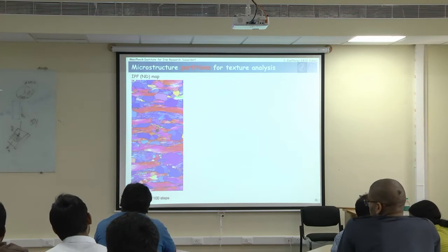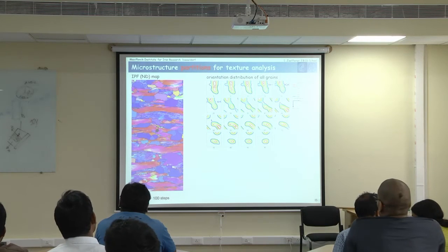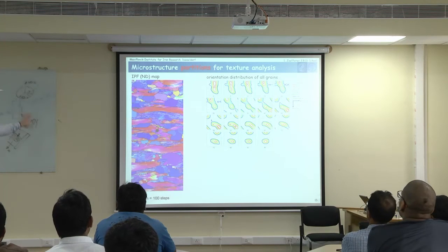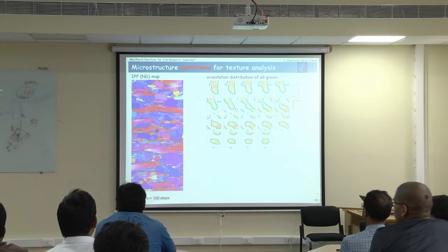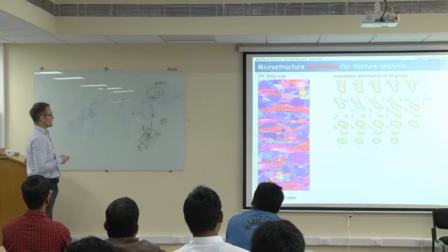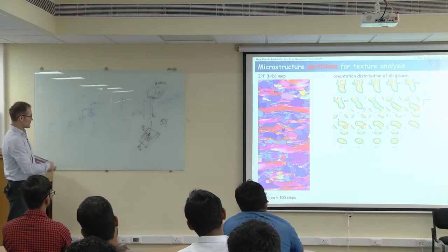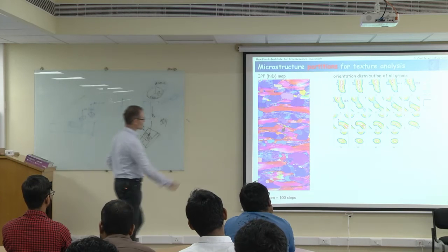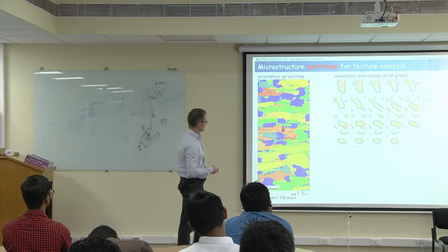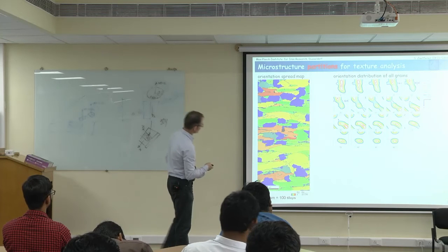And that's what I wanted to do with you. I wanted to calculate the orientation distribution of it. But I wanted to do this after I had worked on this separation. But okay, now we can't. We somehow have to do it with the finished calculations. So this is the Euler space of the whole sample here. That means the orientation distribution function of all grains here. And where are the pole figures? I don't show them? No, then I will show it later.